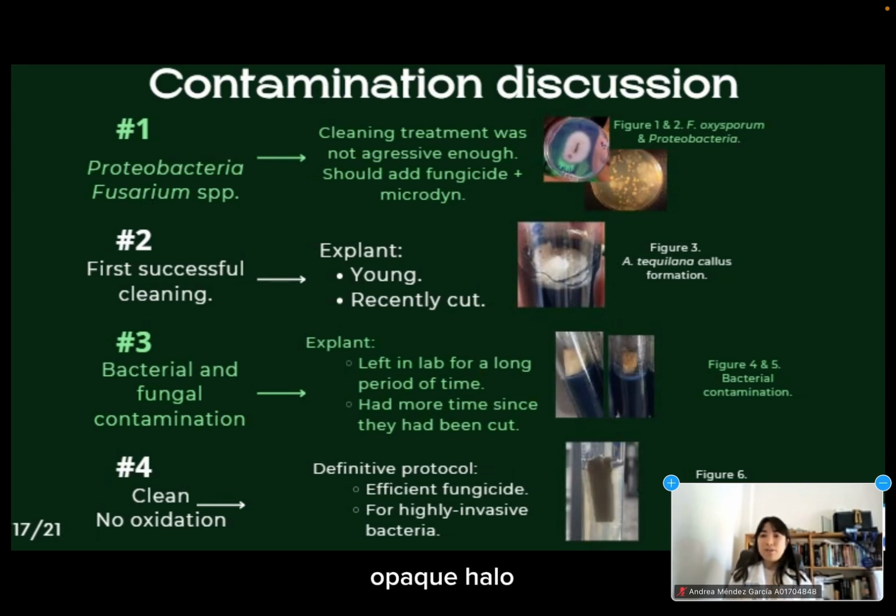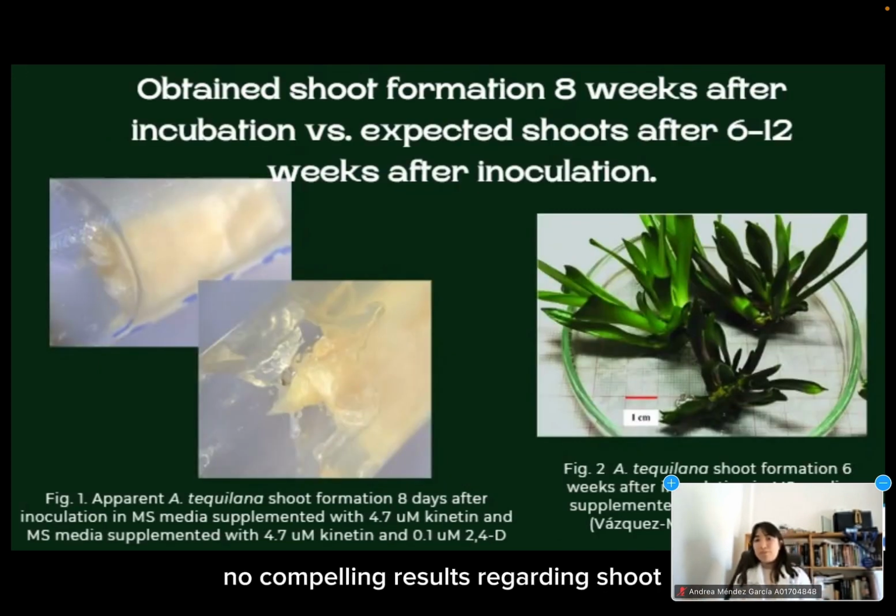However, a white opaque halo was present in all the tubes around the explant. Nonetheless, no compelling results regarding shoot formation could be obtained since the first tested cleaning protocols proved inadequate for achieving a sufficient level of cleanliness in the explants.